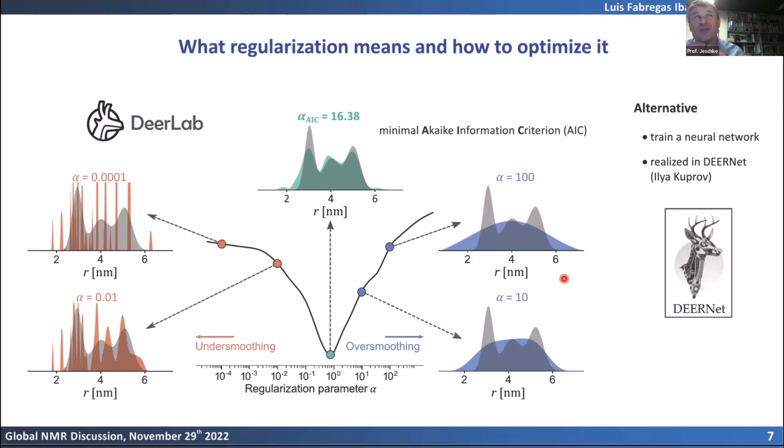So this restricts you to maybe, in one doctoral thesis, 50 restraints or something like that. If you have proteins of this size, then you may need something between 20 and 50 restraints, and then you can make maybe 2 structures per thesis, but not much more.